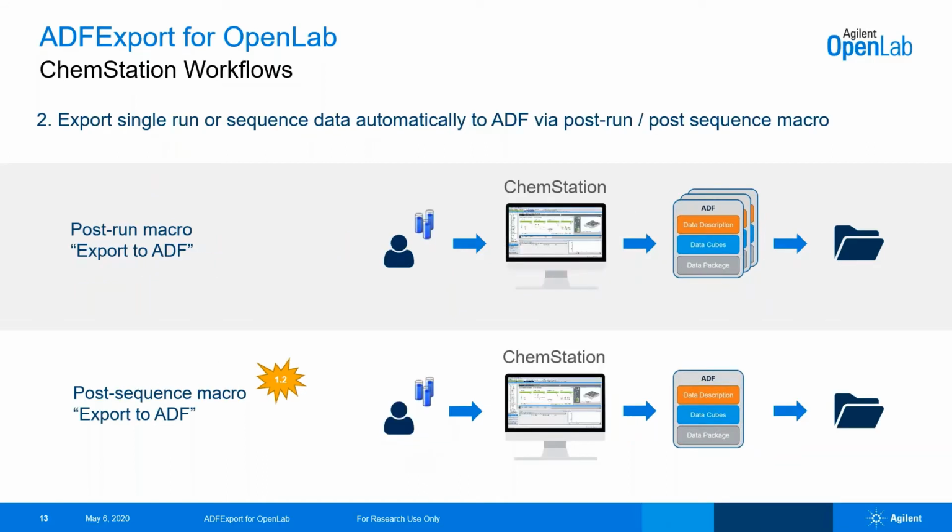Additionally, you can export your data automatically to ADF. This can be either done by using a post-run or a post-sequence macro. In the first example you see here, this is done by post-run macro on a run-by-run basis. And in the second example, the export is done sequence-based.